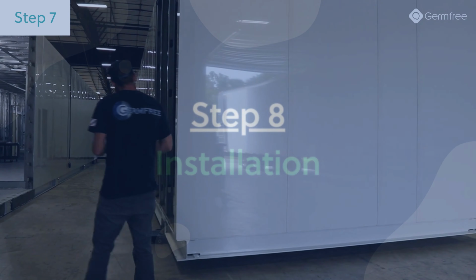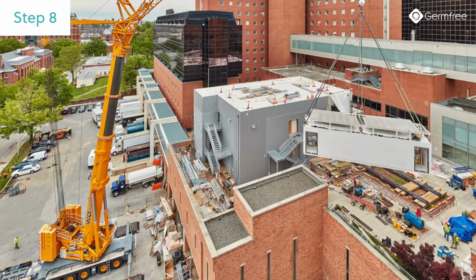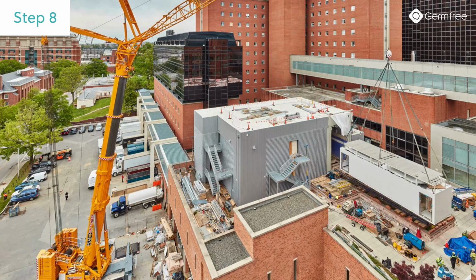Before delivery, we collaborate closely with you to prepare the site for installation. This includes reviewing groundwork, utilities, and infrastructure requirements, everything that could impact the process. By planning ahead, we prevent delays and ensure your facility integrates seamlessly once it arrives. The result is a smooth, efficient installation that sets the stage for immediate operation.